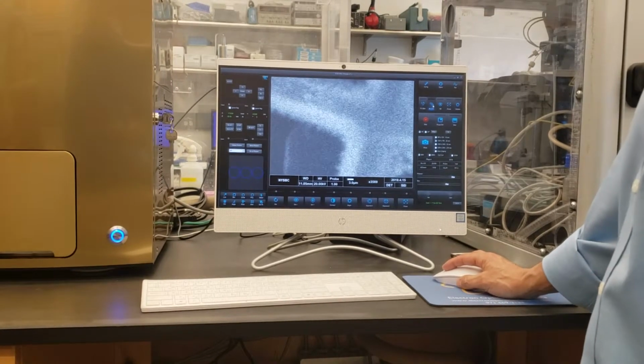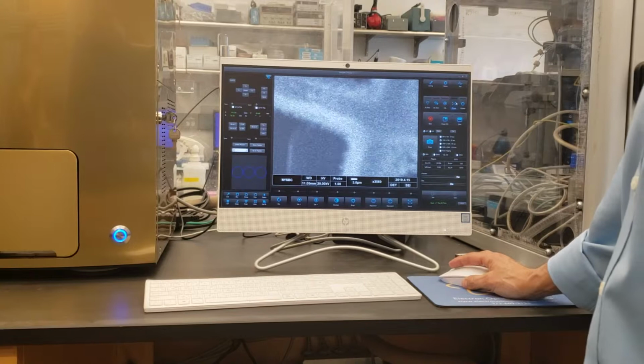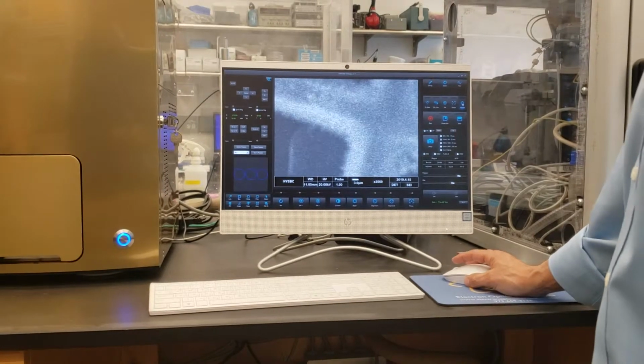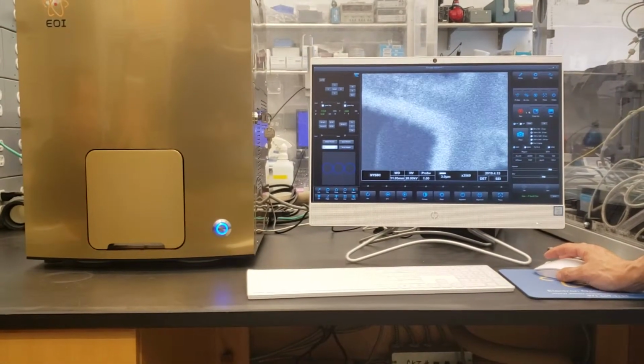This does an automatic brightness and contrast. This does an automatic gun alignment. This will do an automatic focus. This will do an automatic wobble. You can click through them, but realistically, as soon as I just work over here, this is a lot easier for me.